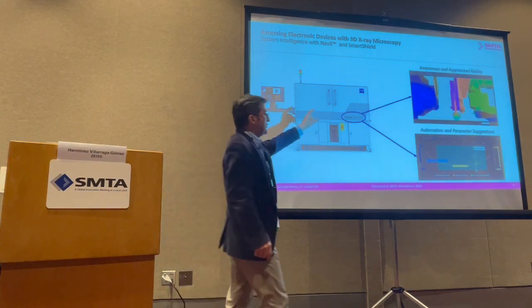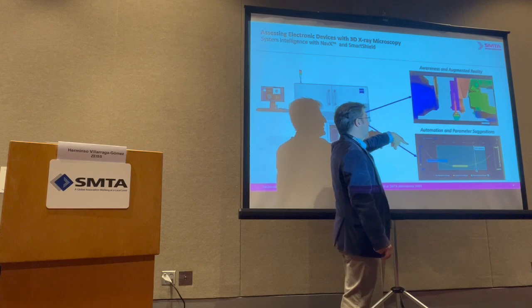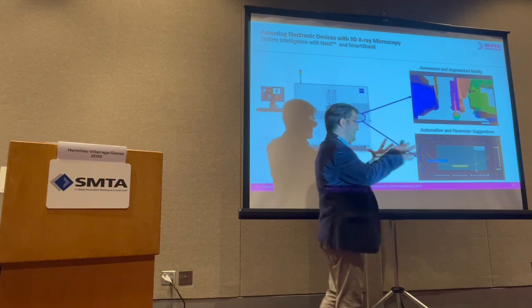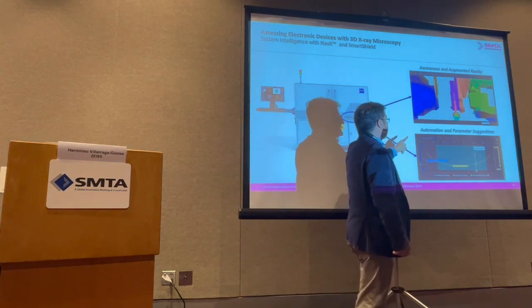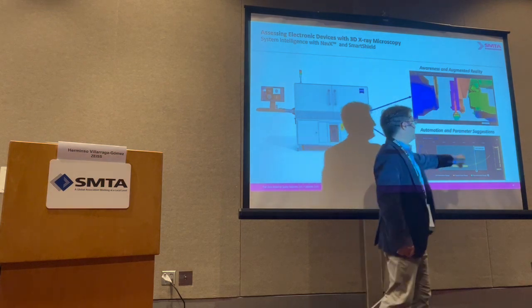Now, additional to doing deep learning training, you could also use some augmented reality settings that take a visual image of the sample and tell you, based on some radiograph settings from the X-ray system, what is the best way to optimize scan time and resolution.